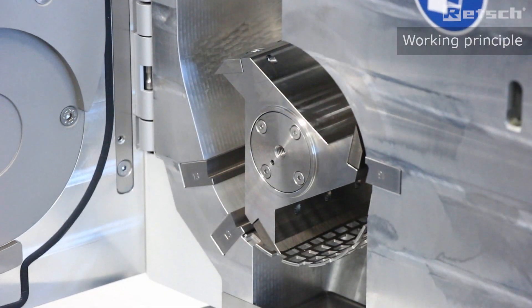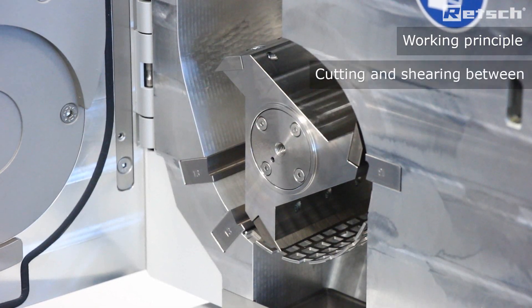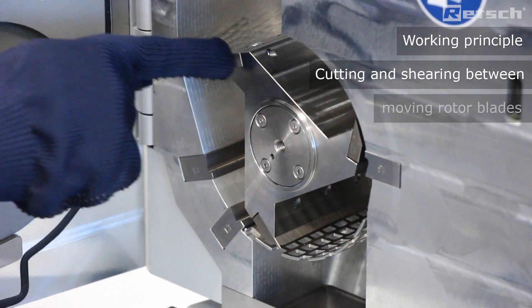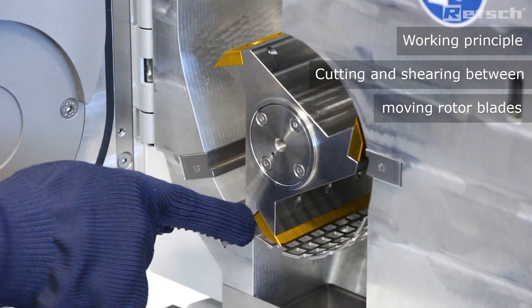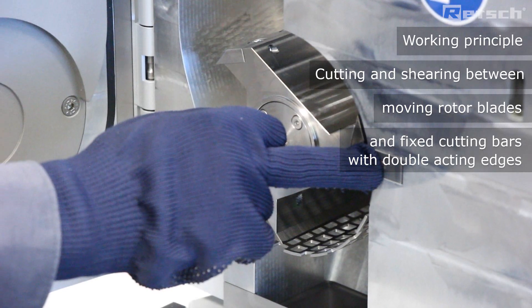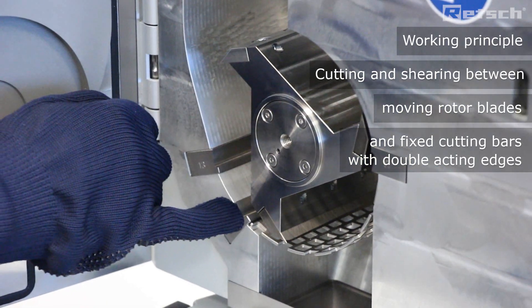The modus operandi of the SM300 exploits cutting and shearing forces. Here with the parallel cut rotor we see one, two, three moving blades and one, two, three fixed cutting bars, all three of which have double acting edges.